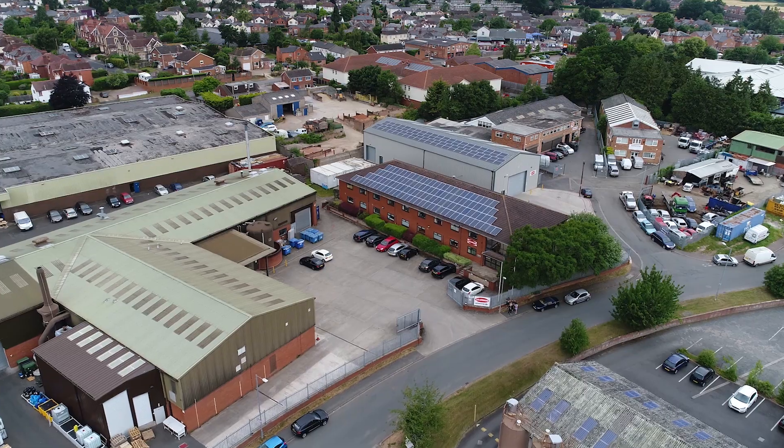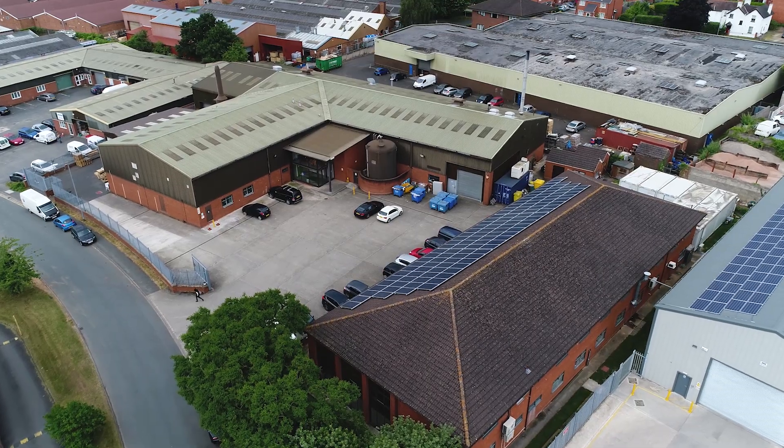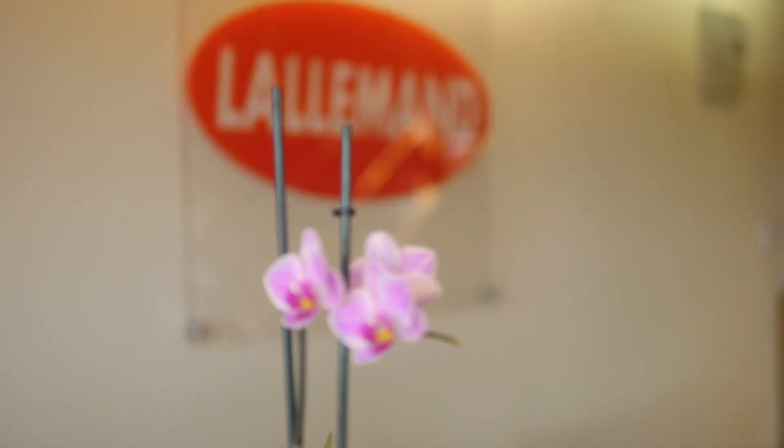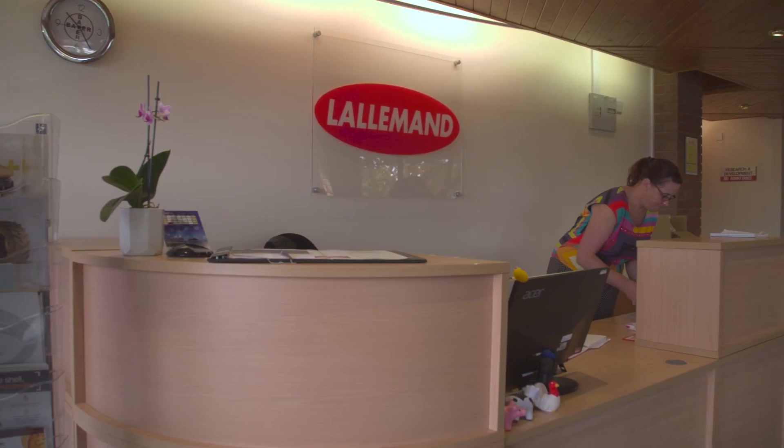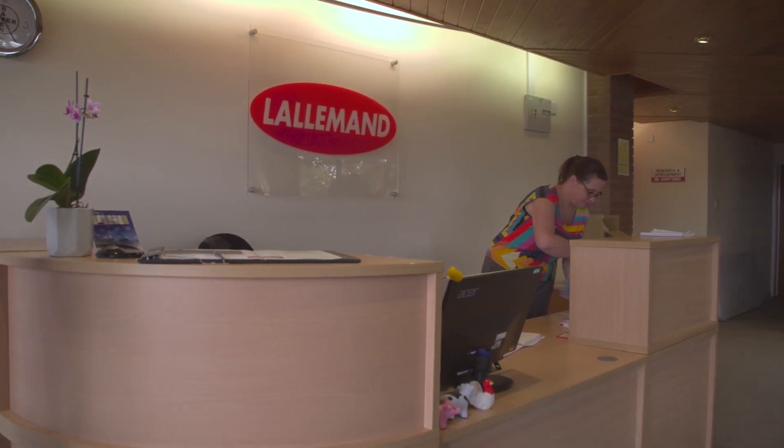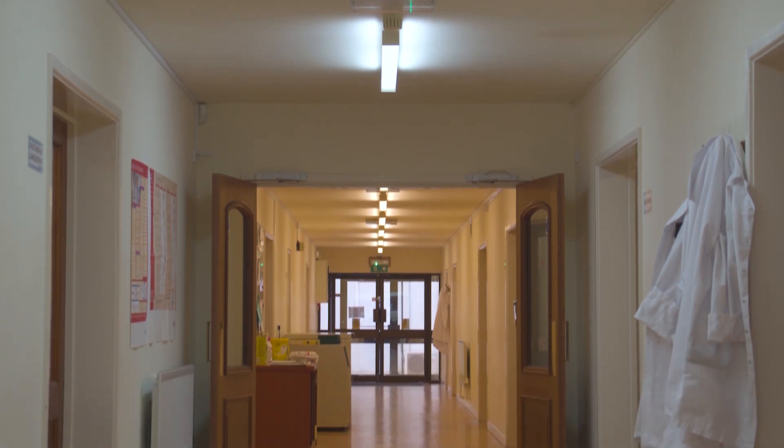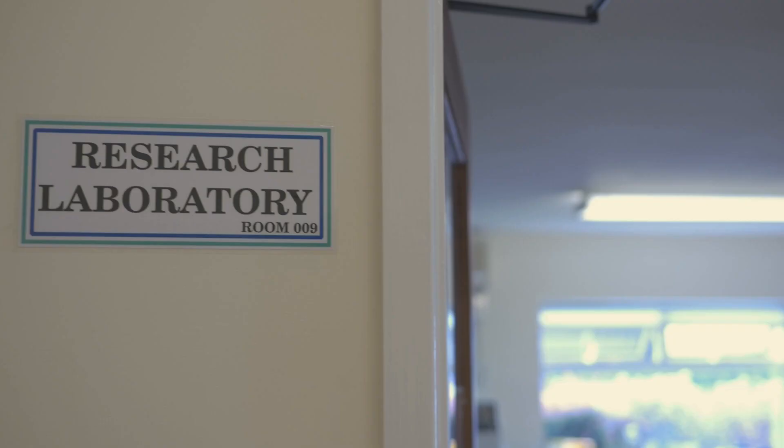Let's take a look inside the production process for bacteria at this plant. Here we ferment, freeze dry, and package approximately 500 bacterial products for thousands of customers. All the bacteria we produce here are used in our range of silage inoculants and animal health and nutrition products.